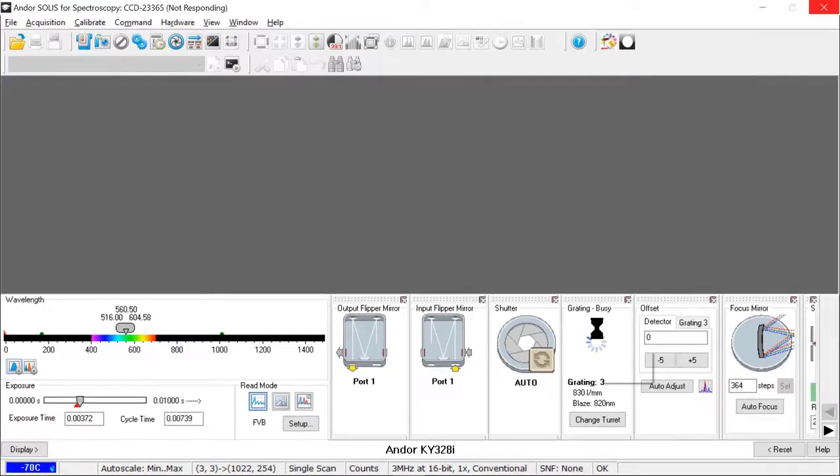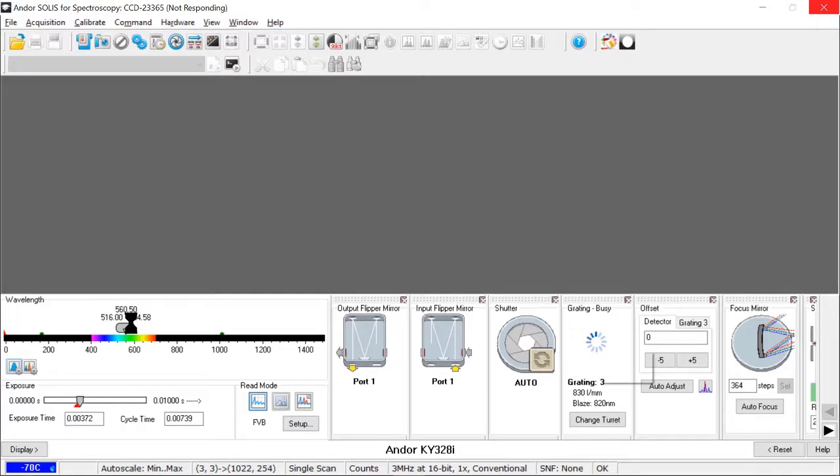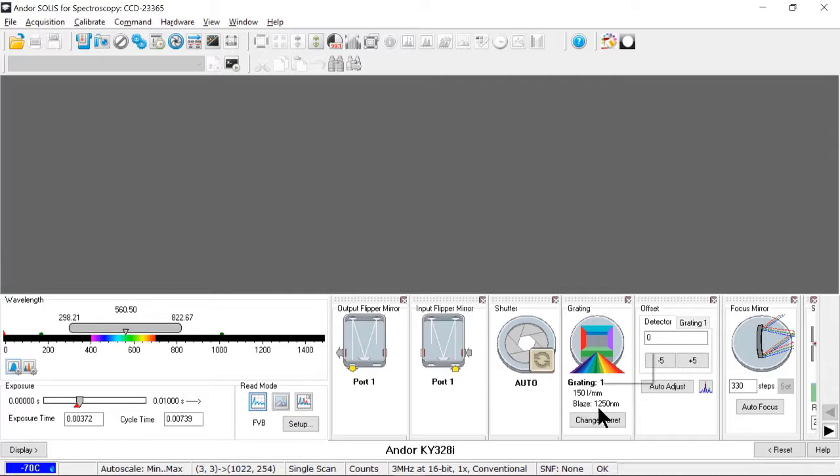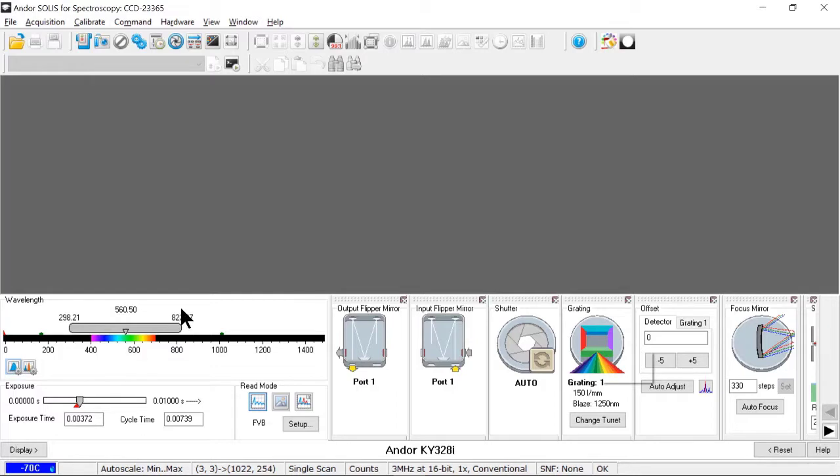When the grating changes, the wavelength selection bar will respond, showing me the bandpass or range of wavelengths for the currently selected grating. So that'll update as soon as the grating is finished changing. I can also click change turret, and what that will do is move the turret under the turret hatch. That is the opening on top of the spectrometer where I can get just the turret out without exposing the rest of the optics. It'll also read the RFID tag at that point and figure out what gratings have actually been added to the system.